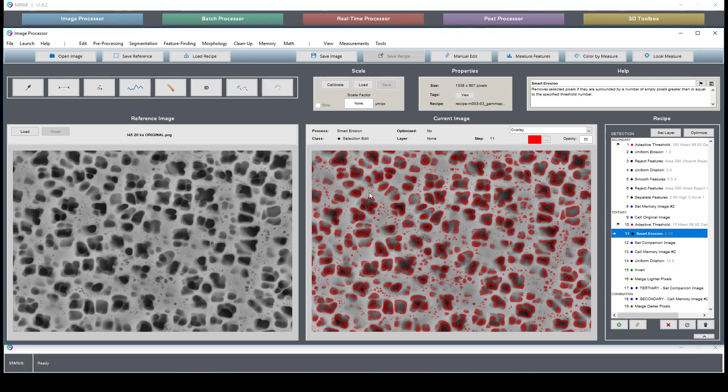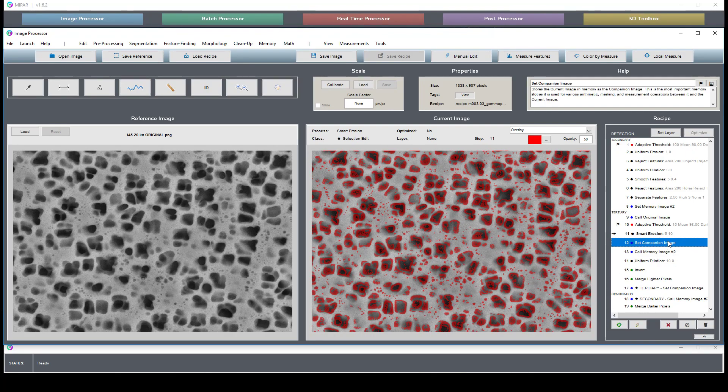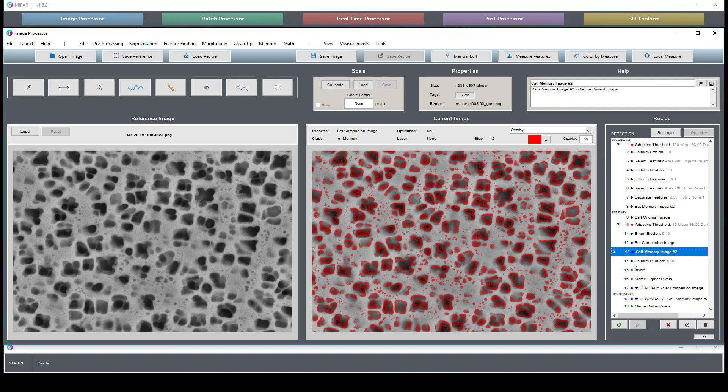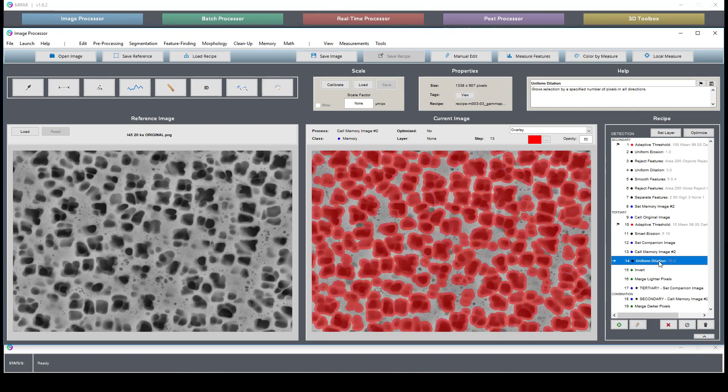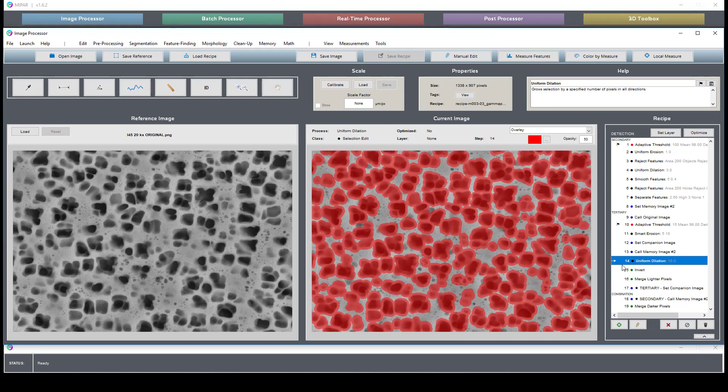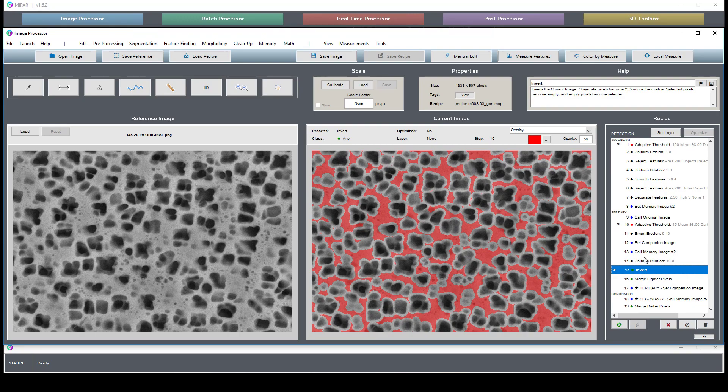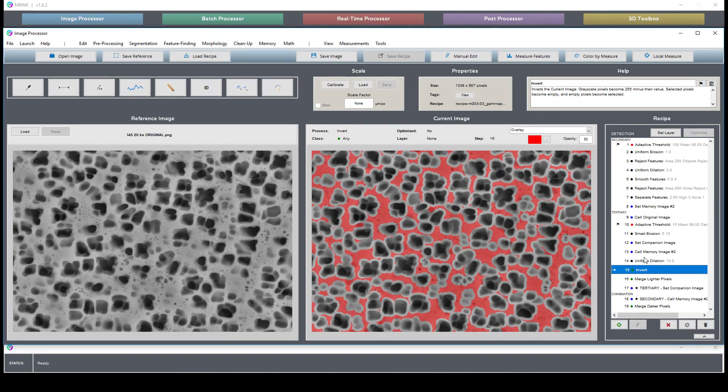where we use an adaptive threshold and manipulate this to do an inverse selection of what is identified as secondary.